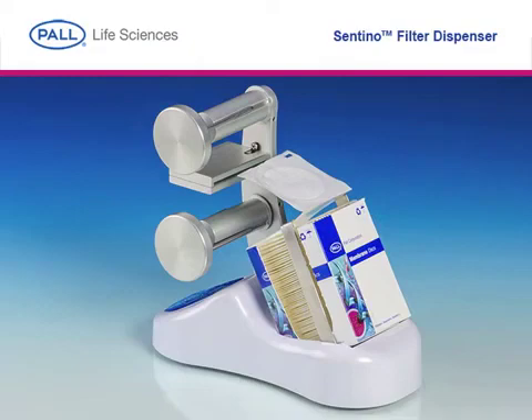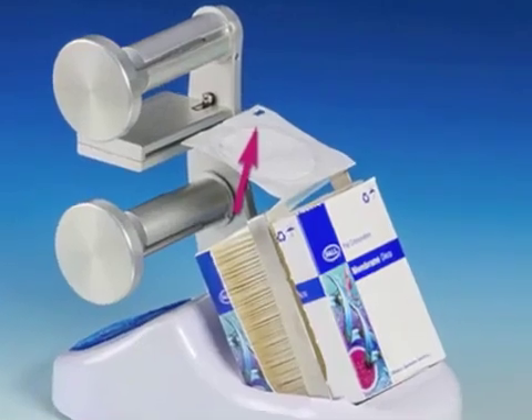Slide the refill pack into the recessed holder on the dispenser as shown, with the rectangular cutouts closest to the upright support.